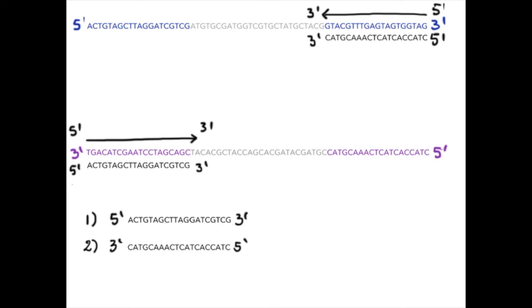For the bottom strand, the sequence is indicated here, and it goes directly from 5' to 3'. For the top strand, the sequence is indicated here, but it goes from 3' to 5'. So one last thing that we need to do before submitting our primers is that we need to reverse the sequence, so that it is now given from 5' to 3'.